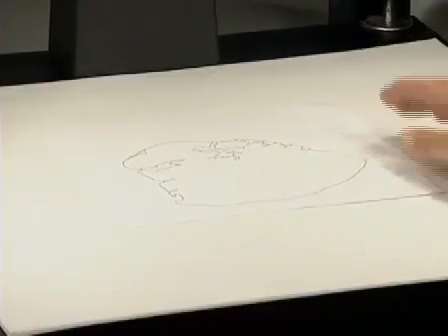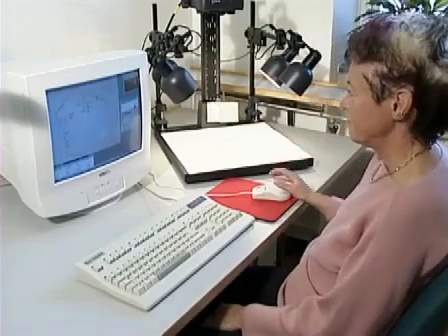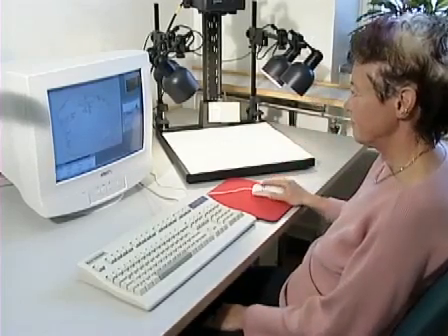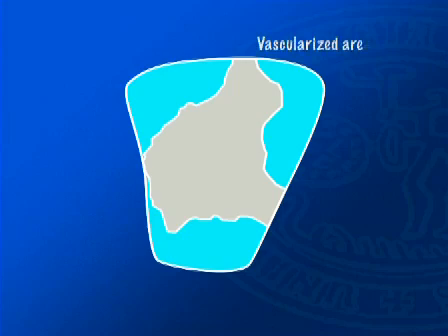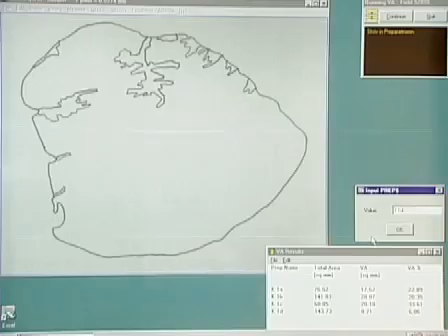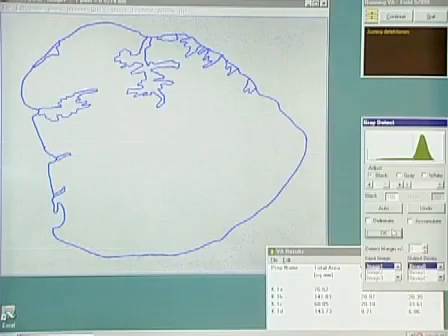The area of all the vascularized parts in a window as a percentage of the area of the whole window is known as the relative vascularized area, VA. It is, to all intents and purposes, a measurement of the spatial extension of the vessels, as they have what is essentially a two-dimensional extension. The VA can easily be measured using computer-aided planimetry, for example.